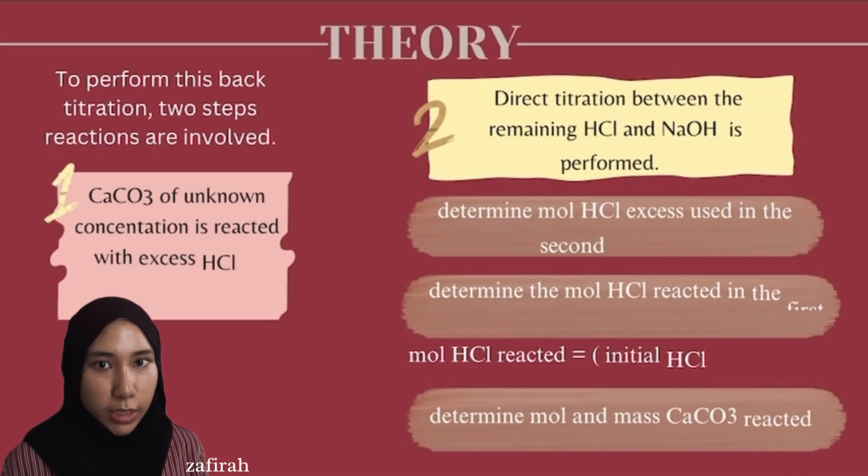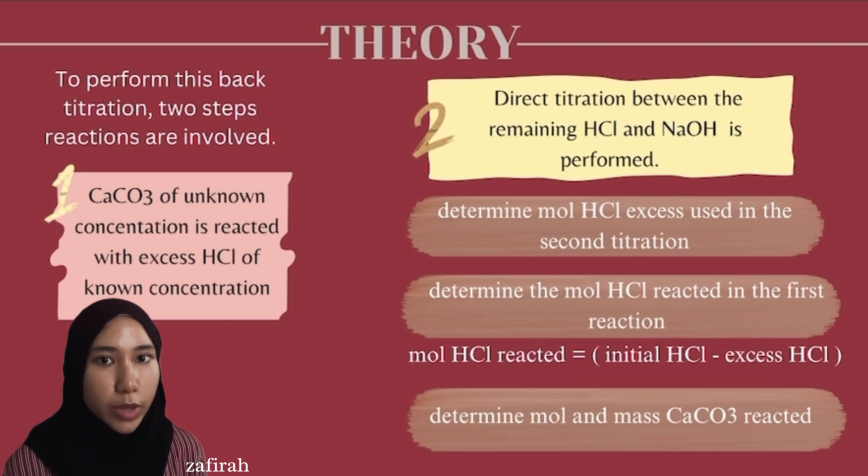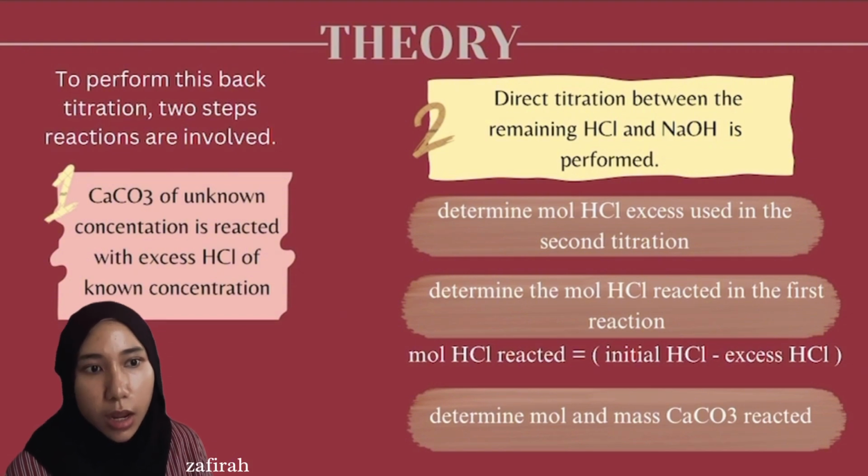To perform this back titration, there are two reactions that are actually involved. The first reaction is between calcium carbonate and hydrochloric acid that is added in excess. And then the second reaction is between hydrochloric acid and sodium hydroxide.